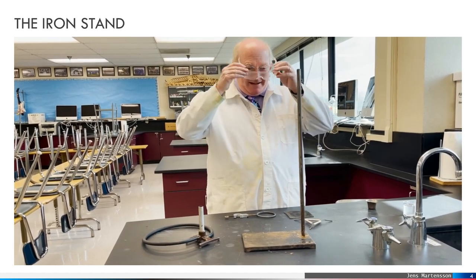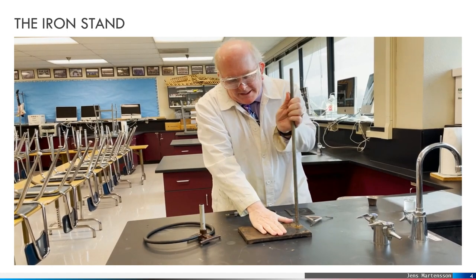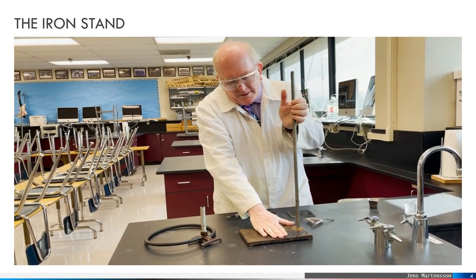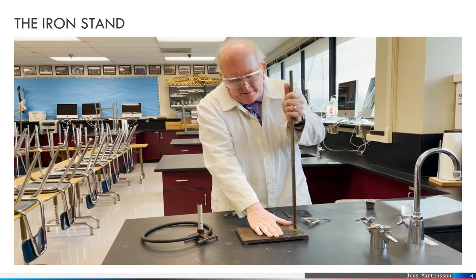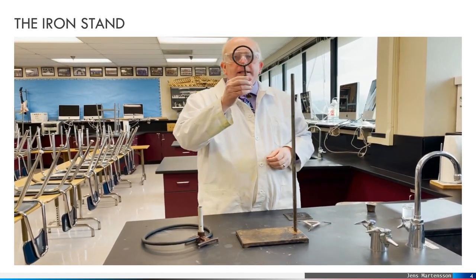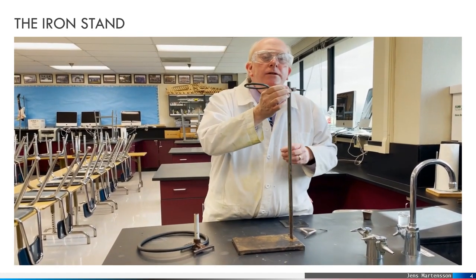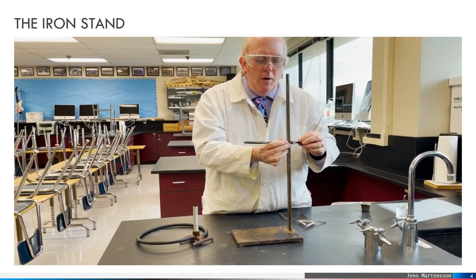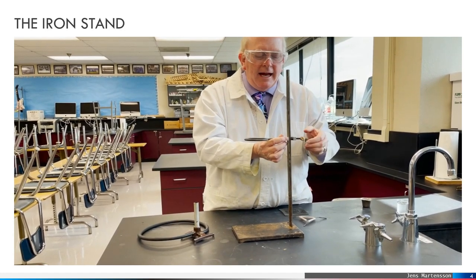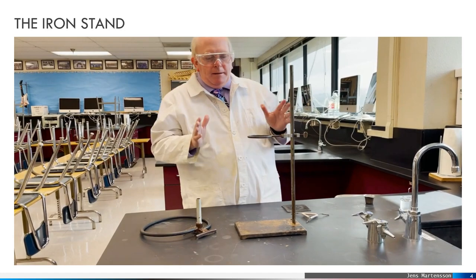What I've got here is a classic ring stand with a ring. These unscrew, so you can take the ring out if necessary. It has a nice heavy base to help keep it steady. This is the ring, often just called a metal ring, and what we can do is put that over the ring stand and tighten up on this clamp, and that holds it in place.